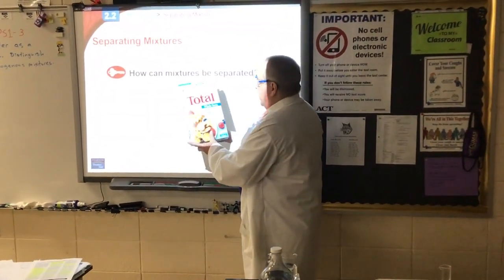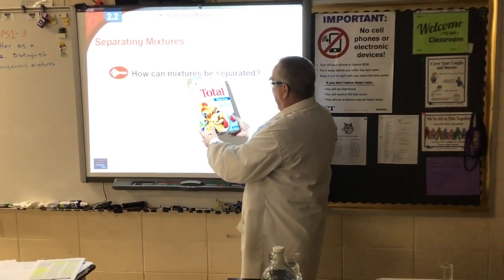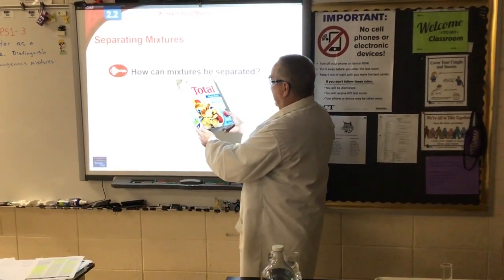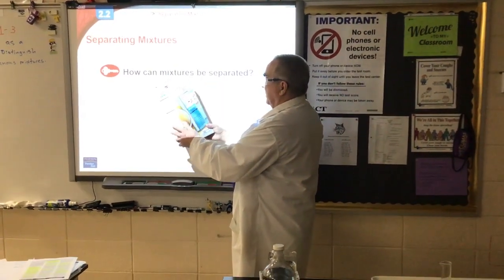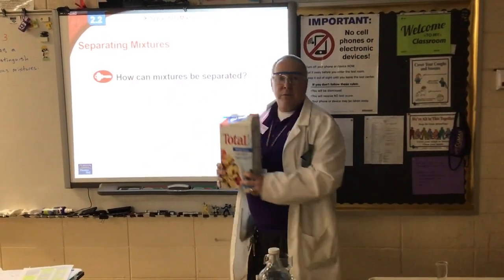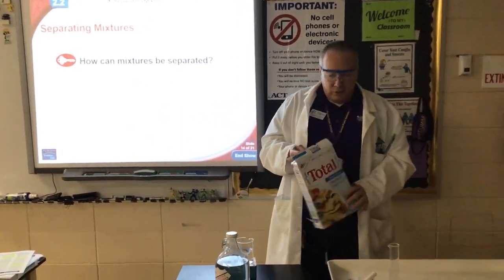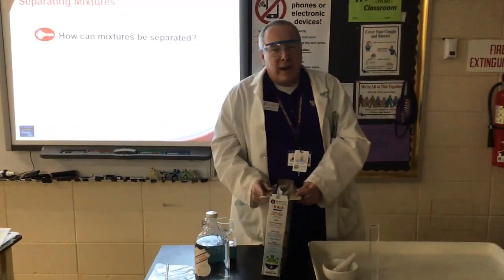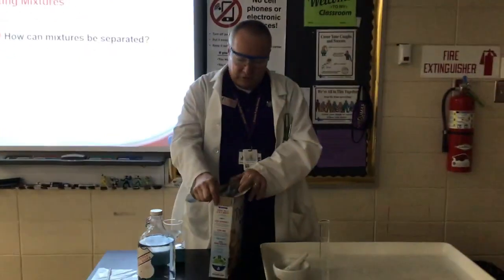And one of the ingredients in Total is that it has 100% of a lot of vitamins and iron that are required in the human diet in just one serving. And the question is, iron? What is iron doing in there, and what form does it take?